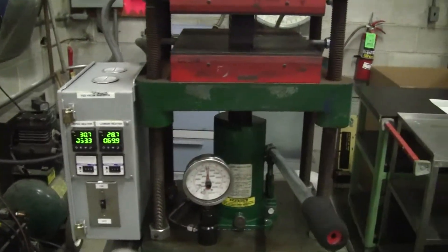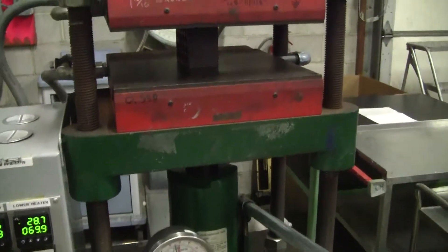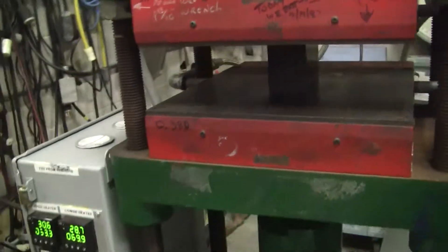Hi, this is Michael Naitow from HitechTrader. Today we're looking at a four-post heated and cooled Carver press. The model number is 2518.